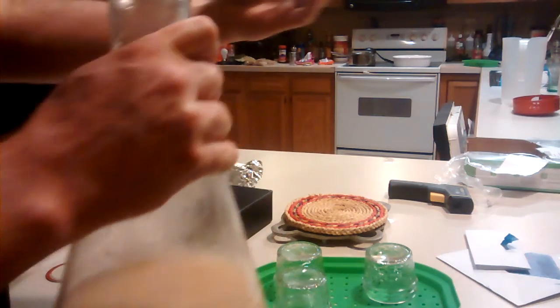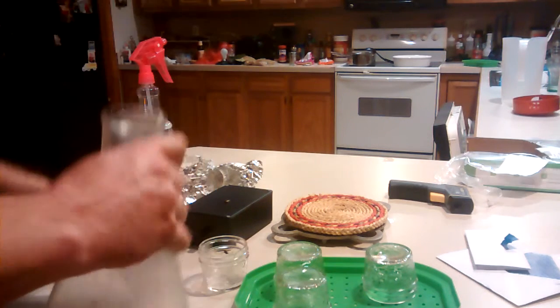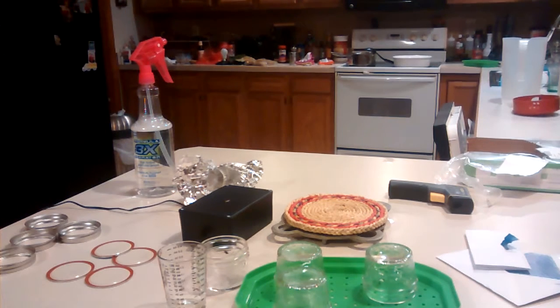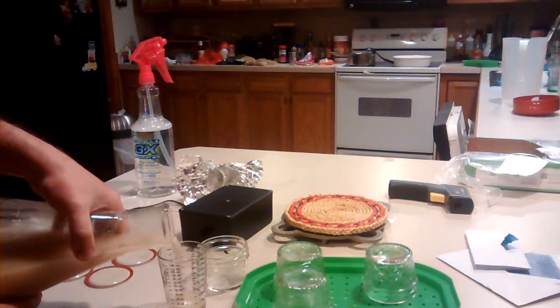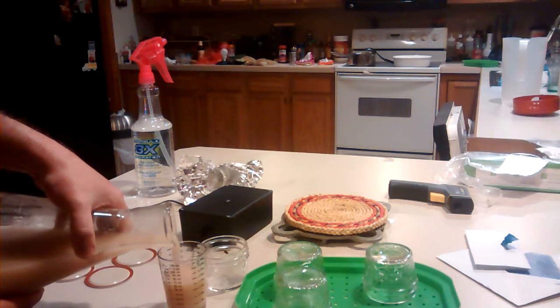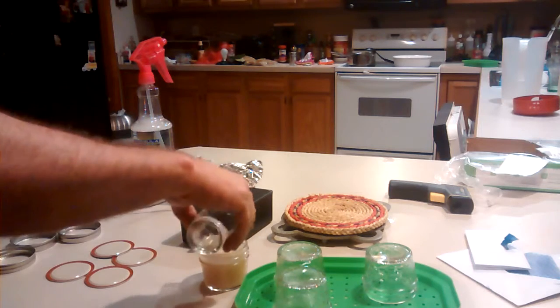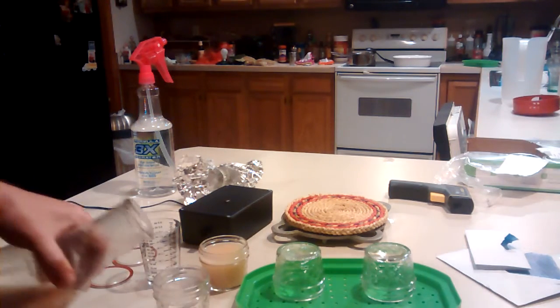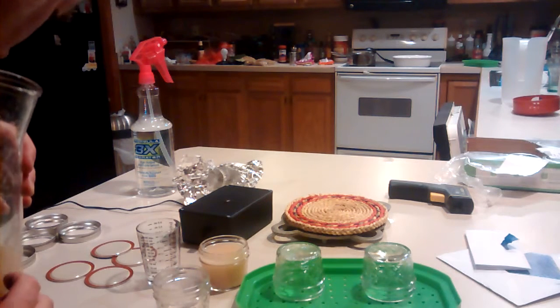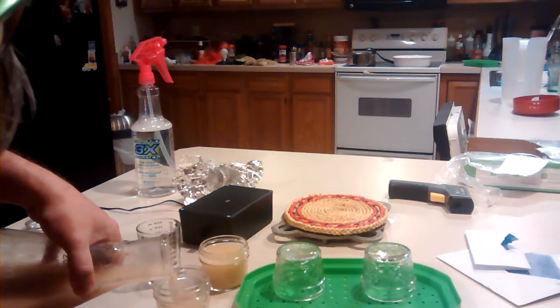And I got this glass that I also boiled in the microwave. That's what we'll use to do my 100 milliliter pours. You see what we got there. I guess you can see, maybe not the numbers, but that's fine. I need to pour it before the yeast starts settling. Ooh, 1. And from there, smells like yeast, that's for sure. It smells like freaking bread.